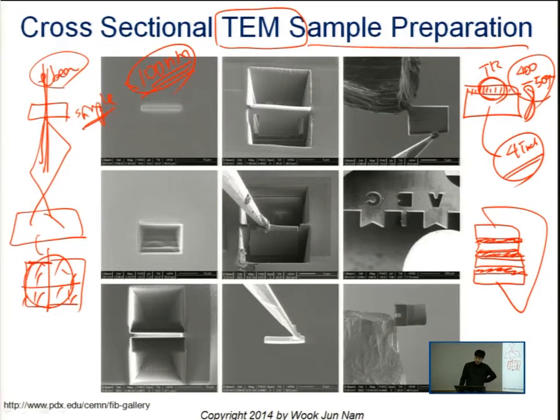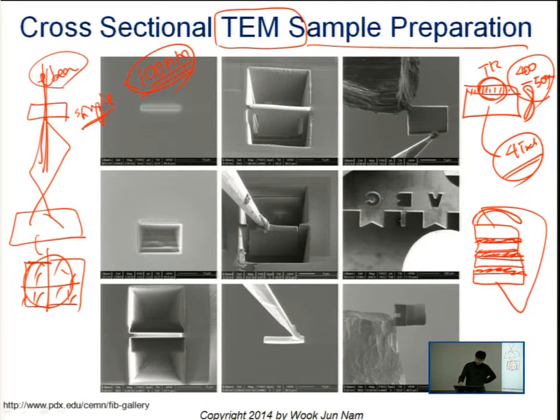After that, what we need to do is grind and polish these samples as thin as possible.